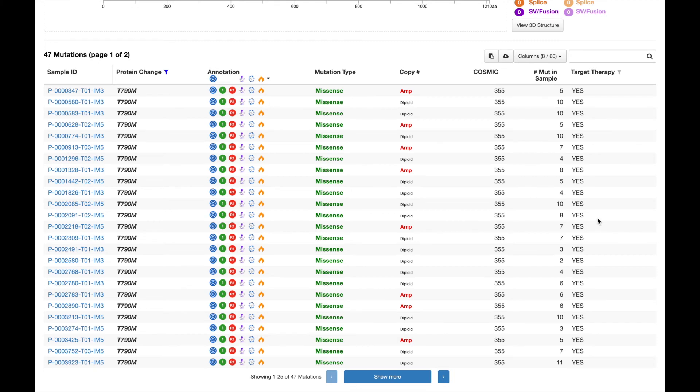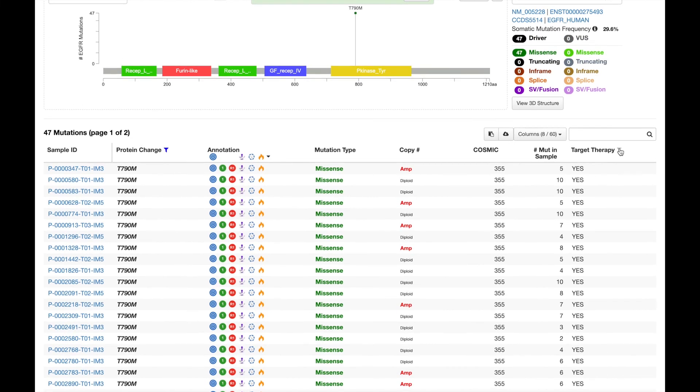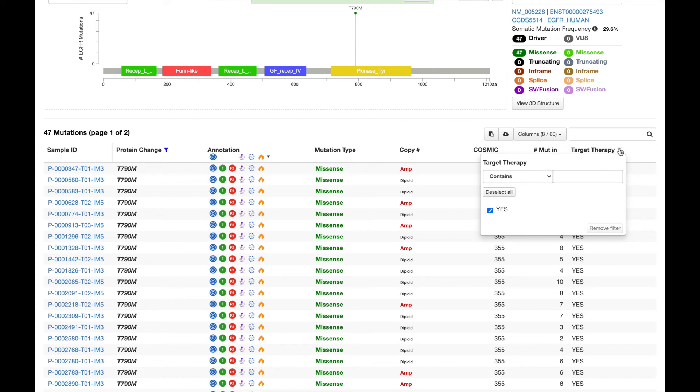We can continue to scroll through the table, or we can actually come back to this filter feature, which also serves to summarize the data, and see that every patient with a T790M mutation has received targeted therapy.